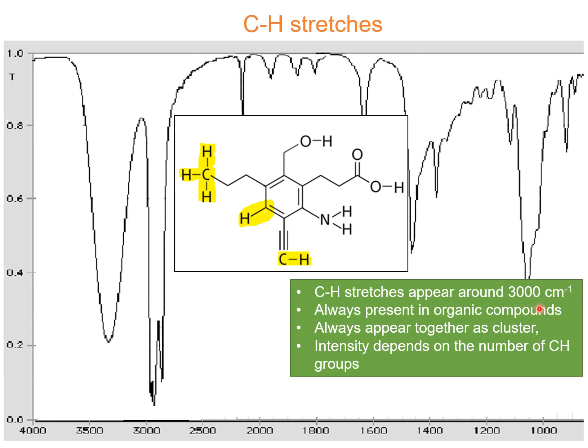In the next level, because now we are at the basic level, we will see different kinds of CH stretches originating from alkane, alkene and alkyne, representing various sp, sp2 and sp3 hybridized carbon atoms. We will look at how they differ from each other.